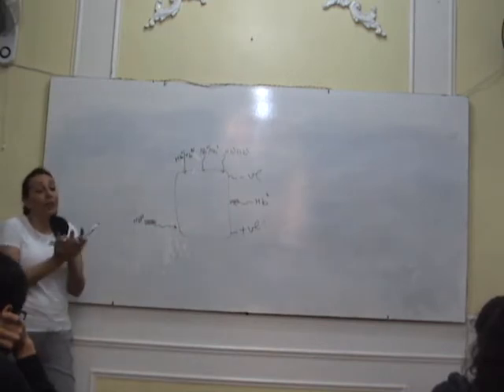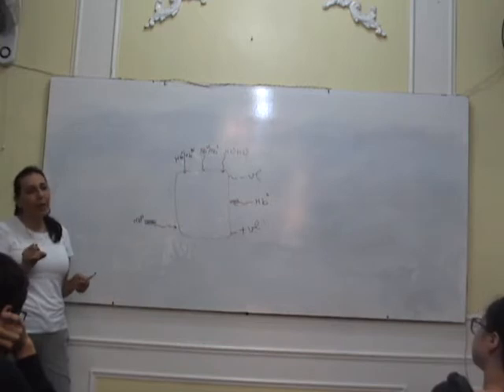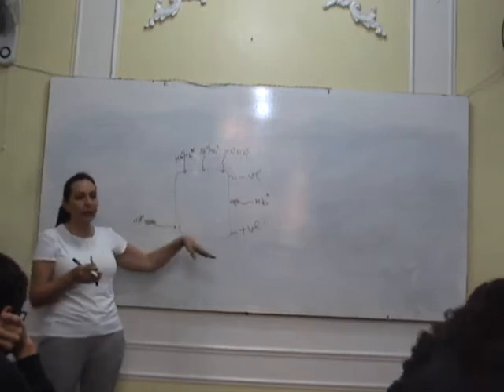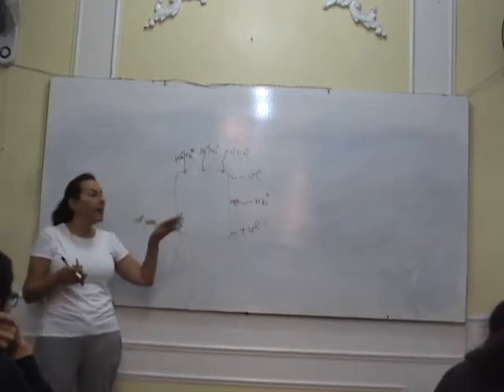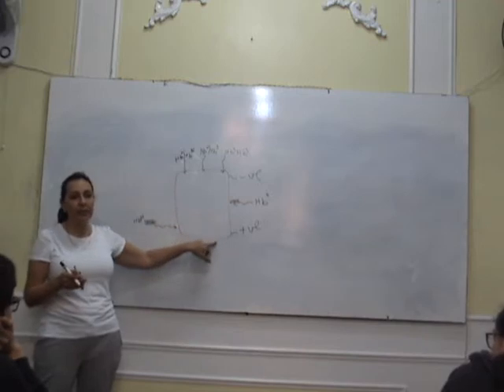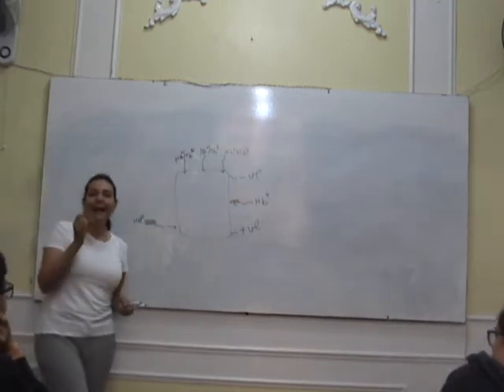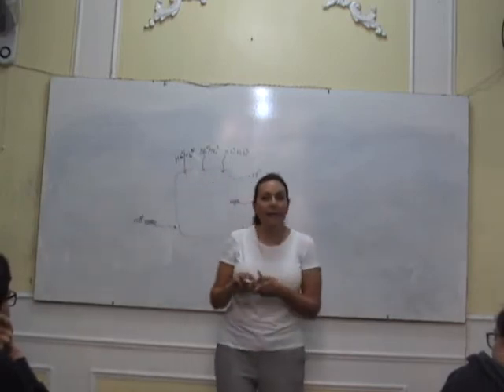لا، البروتين كله عليه charges، في عليه أمينو أسيدز ثانية. البالين بس هو اللي ما عندوش شارجز فهو it moves less further، less charges، ف it moves less towards the anode. النورمال هيموف اكثر towards the anode. اوكي الايديا بقى بتاعت الباندنجز.